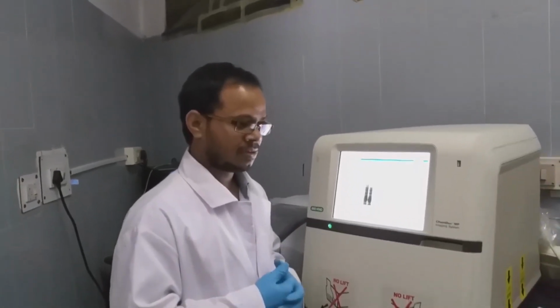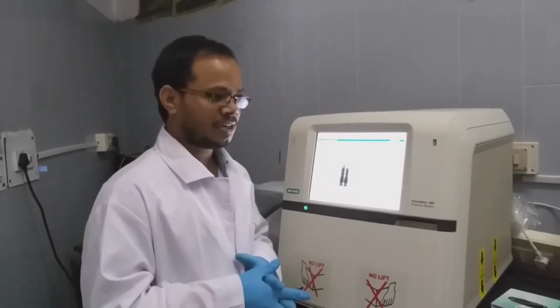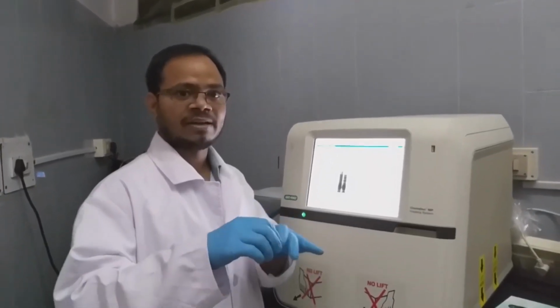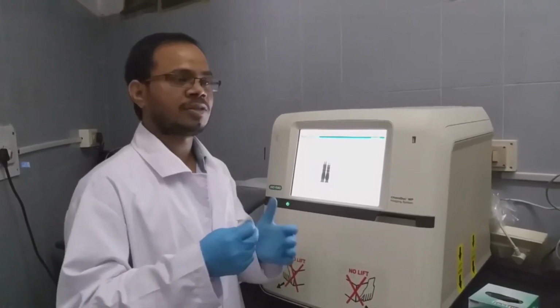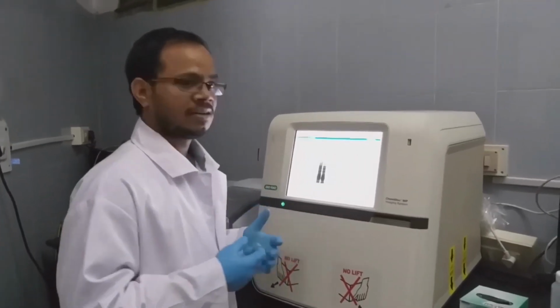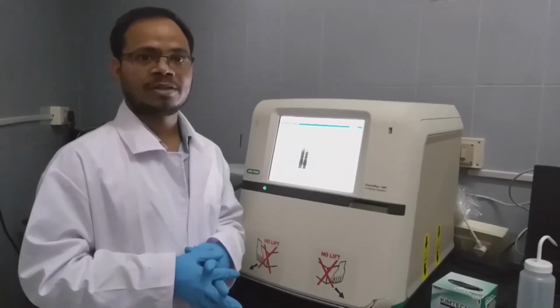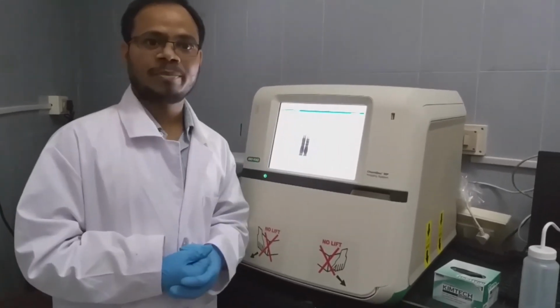These are all the other bands we are seeing in the eluted fractions, and those are because of contaminants or degraded protein. Contaminants sometimes may come because of three or four histidines in the folded state, which gives the possibility to bind to the nickel NTA column. Also, vigorous washing should be done. If you don't wash properly with a high amount of imidazole, that will give you this kind of non-specific binding.